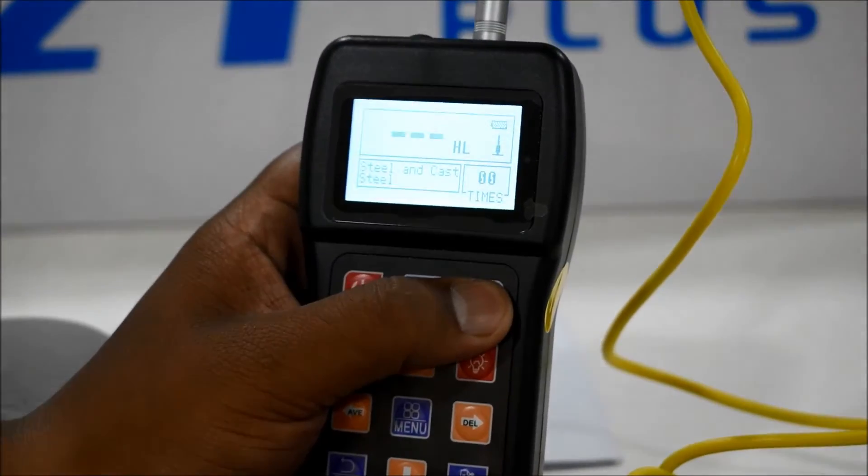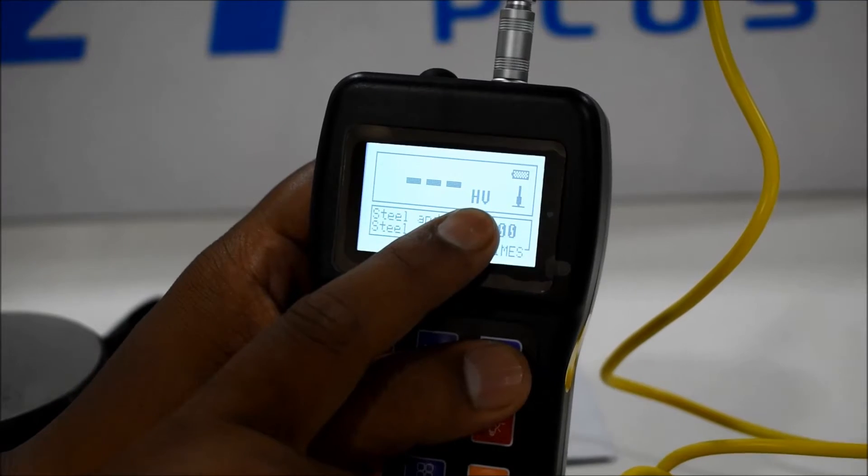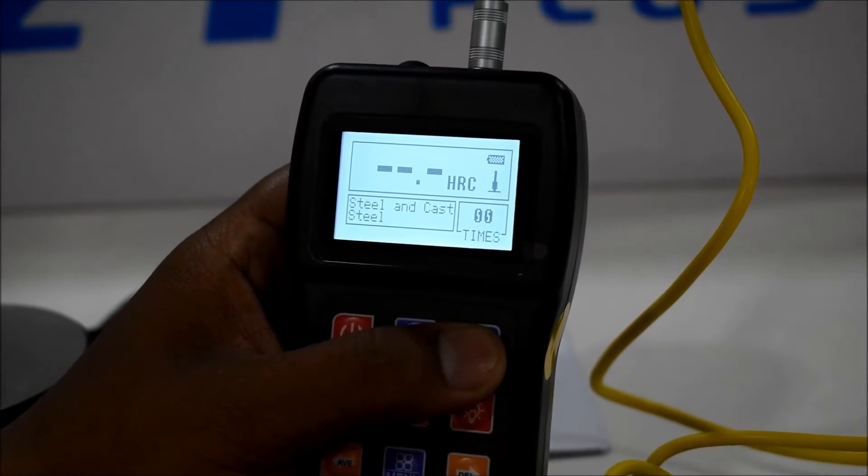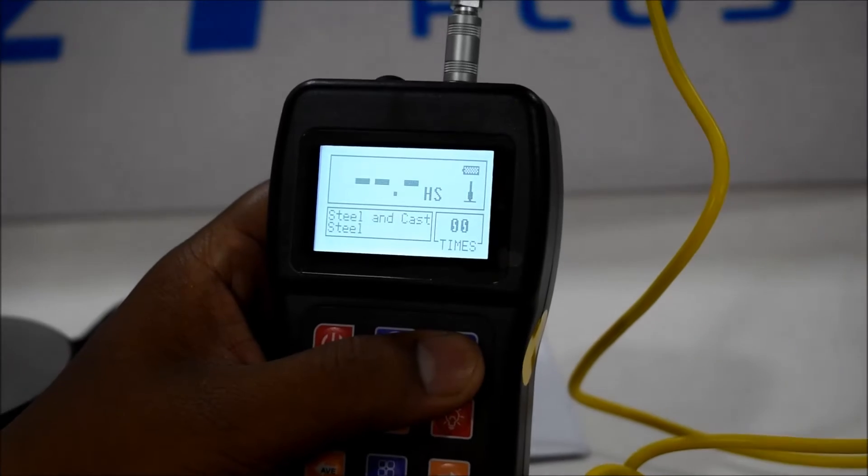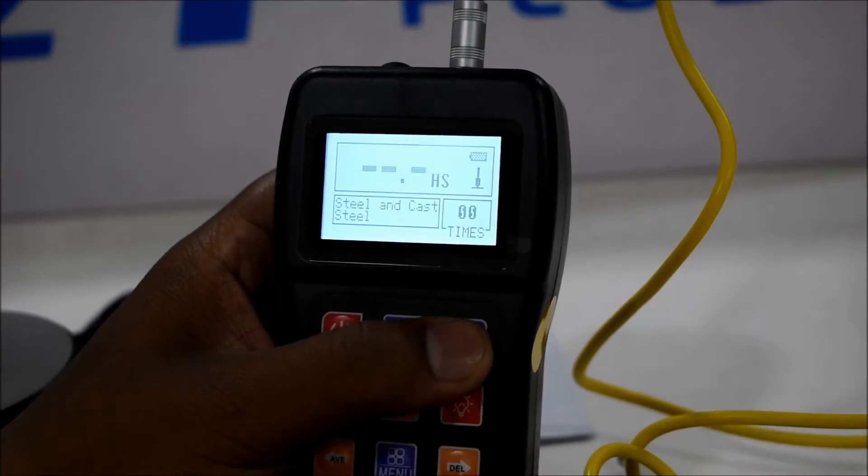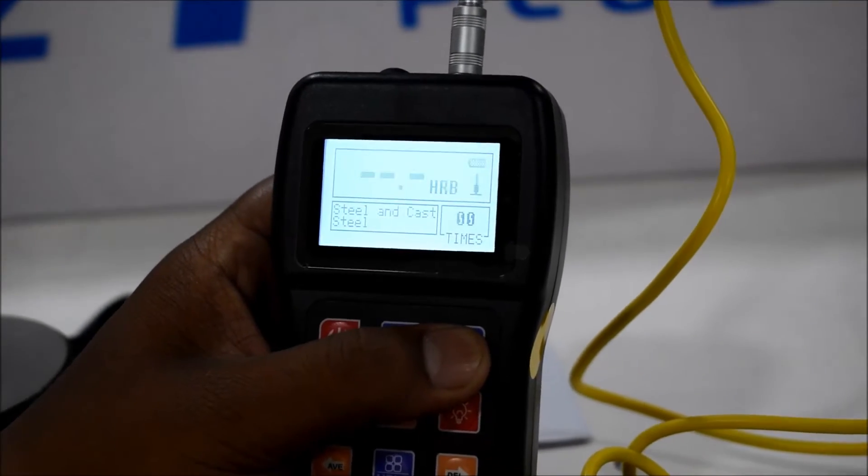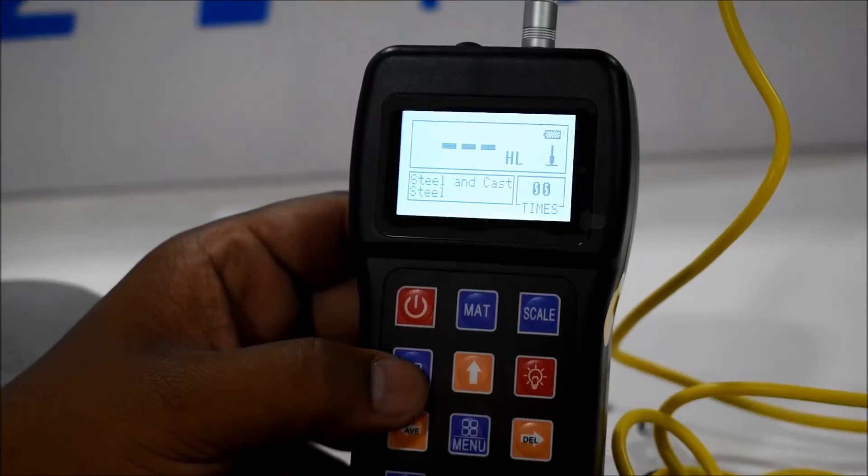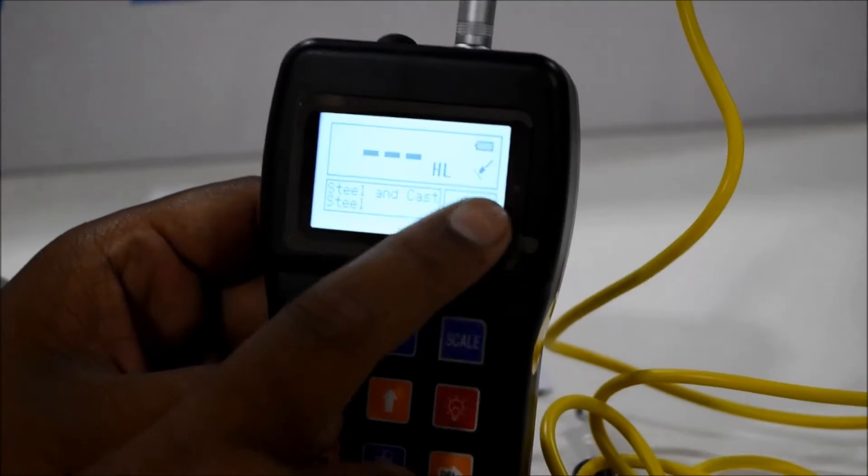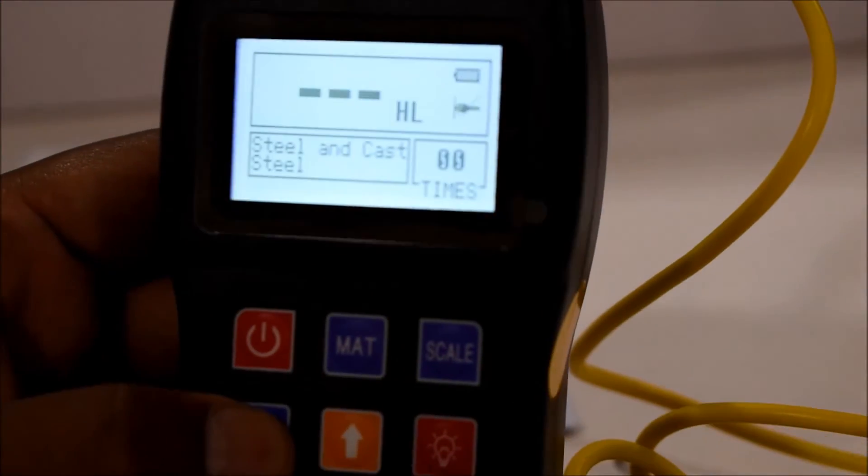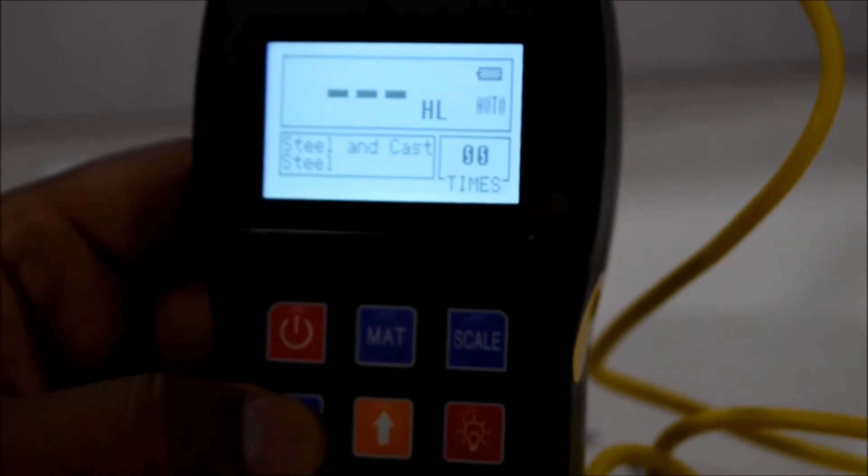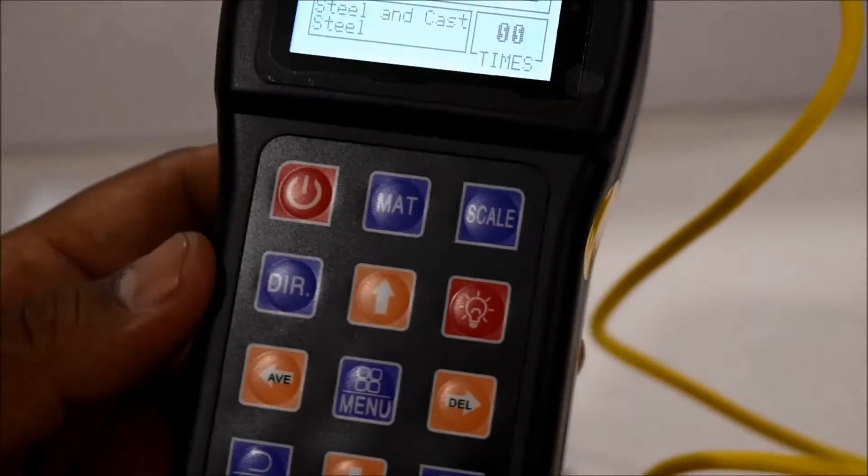For calibration, we provide you HV, HB, HRC, HS, and HRB scales. Set the probe direction, then lock out. When the probe changes direction, it gets it automatically. We will set a down type probe.